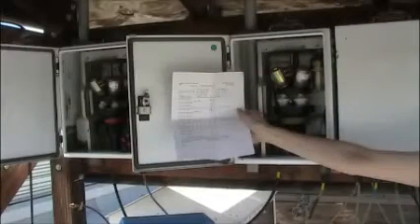When you arrive at the site, each module should already have a set of cartridges installed in them. The week 3 log sheet for the cartridges currently installed should be present at the site. Print your initials, the date, and the time in the final reading section of the log sheet.